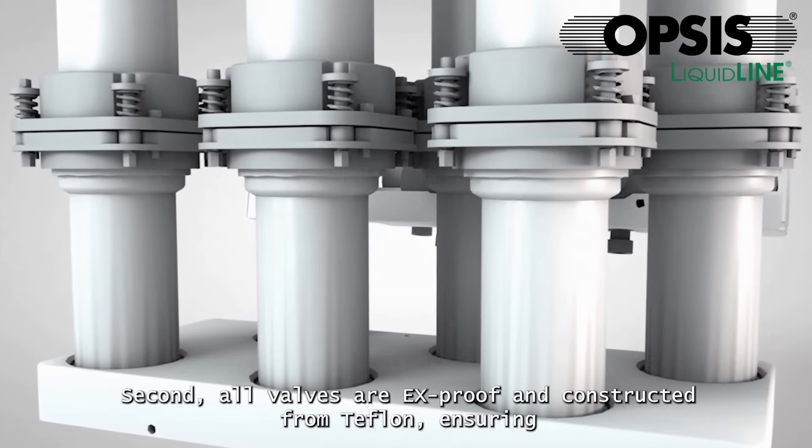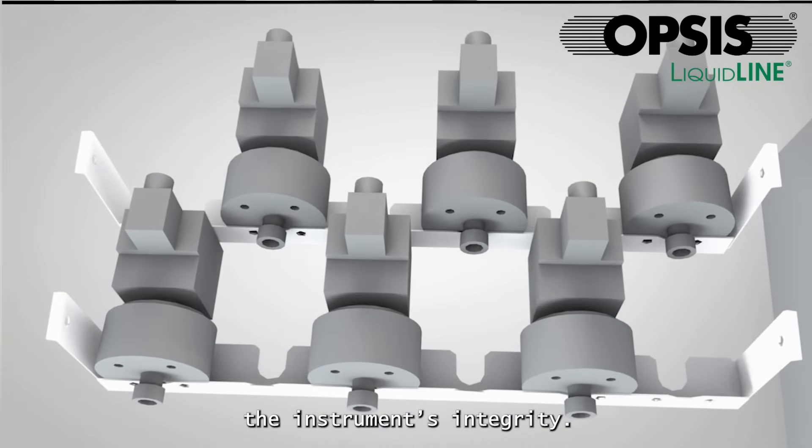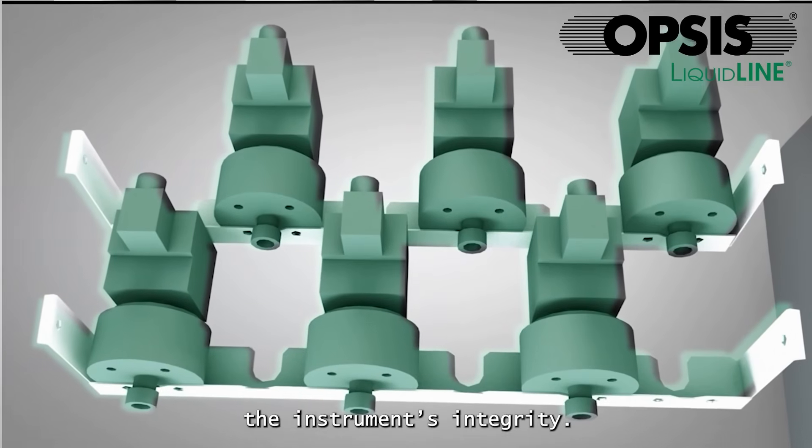Second, all valves are explosion-proof and constructed from Teflon, ensuring safety and compatibility with various solvents without compromising the instrument's integrity.